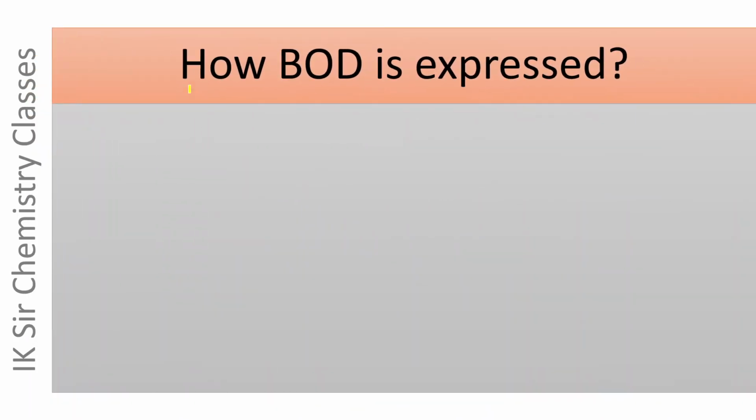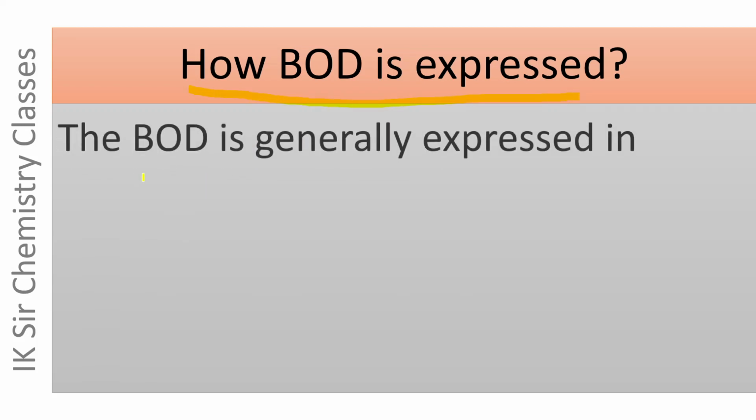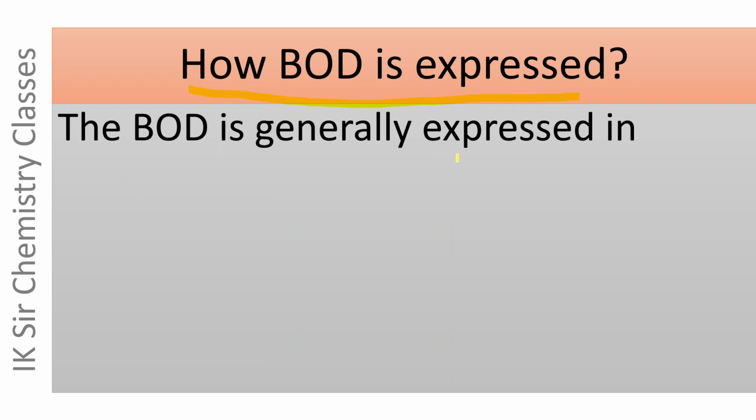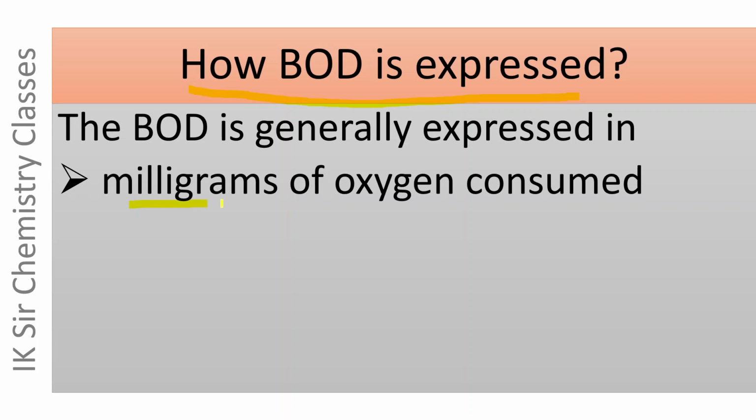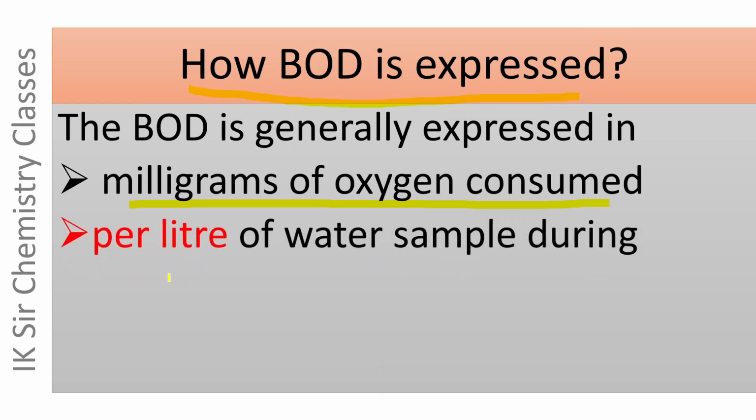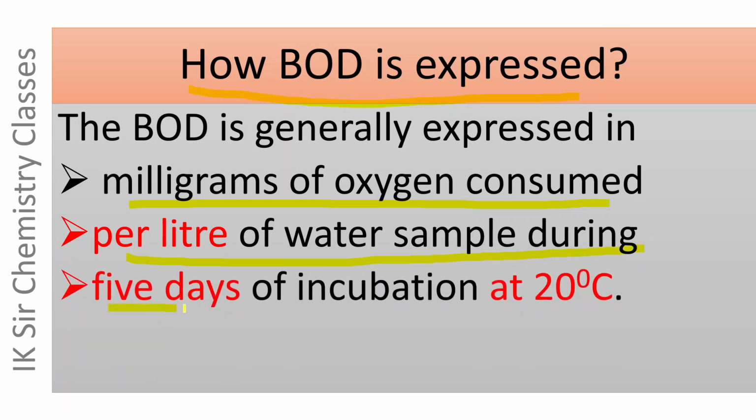How is biological oxygen demand expressed? The BOD is generally expressed in milligrams of oxygen consumed. How many milligrams of oxygen are consumed per liter of water sample during 5 days of incubation at 20 degrees centigrade.